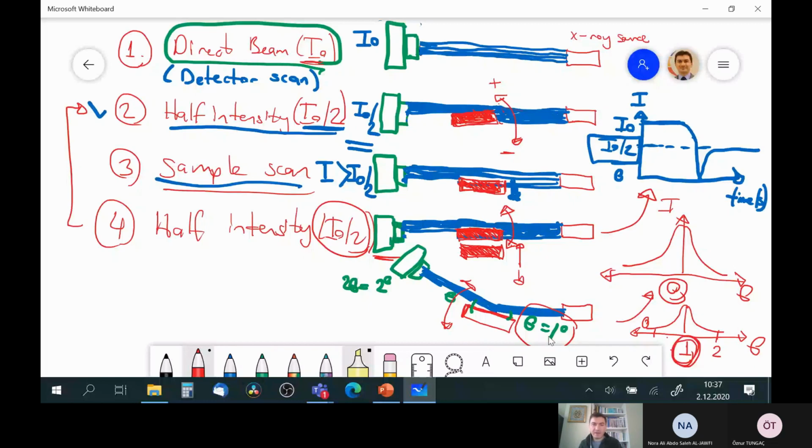But sometimes this position can be shifted to the left or right side. Let's say here we have 0.9, and here we have 1.1, okay? Then, for example in the blue case, you have to say move theta to 1.1, then set theta to 1. Then you have the right position, and you can start the experiments.